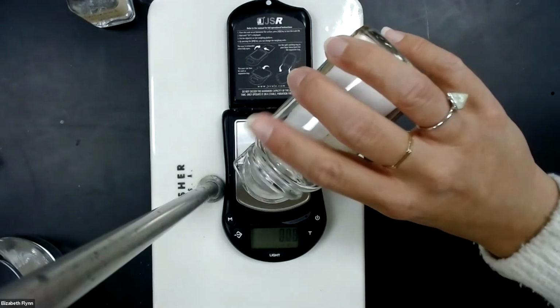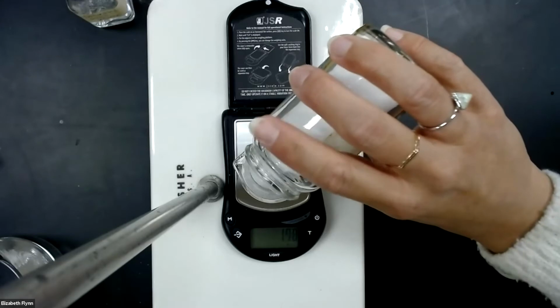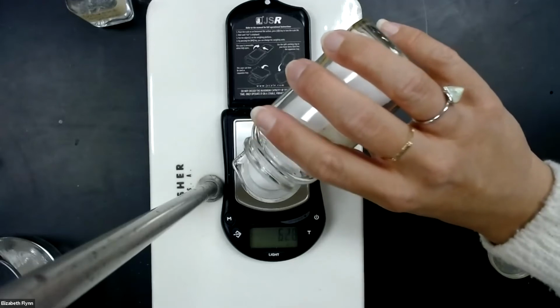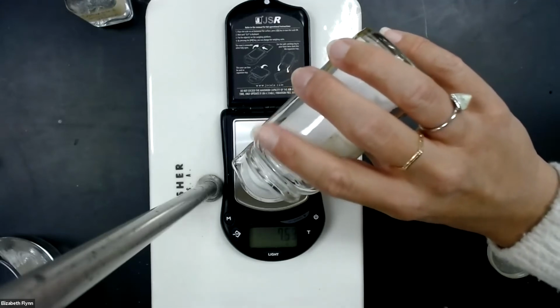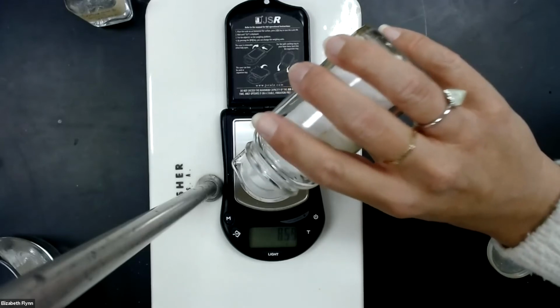I'm going to add 14.0 grams to make a saturated sodium chloride solution, meaning it's saturated with salt. The water cannot hold any more salt. It has the maximum amount of salt dissolved in the water.